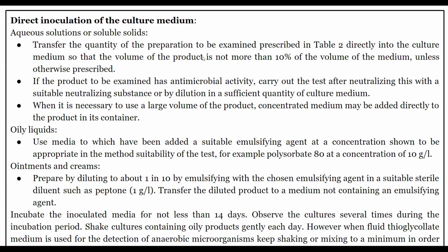Next case is when it is necessary to use a large volume of the product. The concentrated medium may be added directly to the product in its container. So in the earlier two cases, we are adding product to the culture medium. But with respect to large volume parenterals, where the volume exceeds 100 ml and can go to liters, in such cases, rather than transferring product to the culture medium, you can make concentrated culture medium and introduce it into the container under aseptic conditions. And then these containers are incubated for sterility testing.